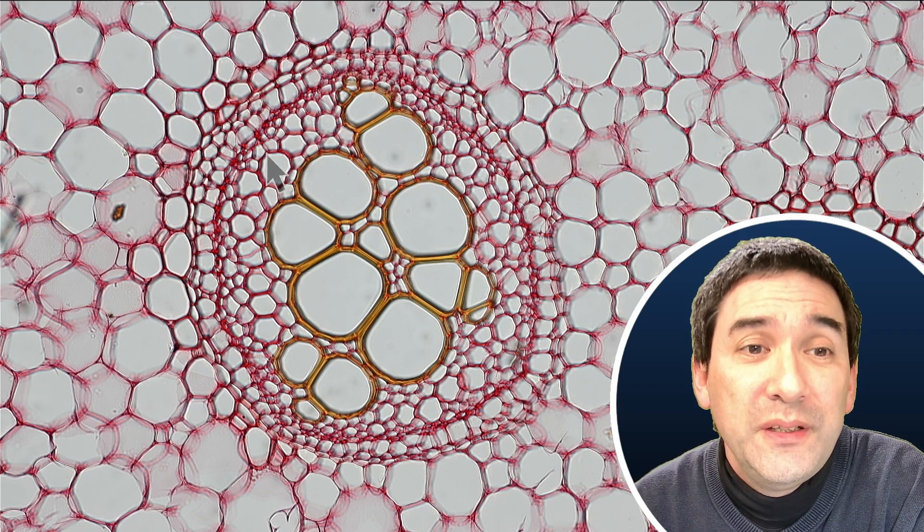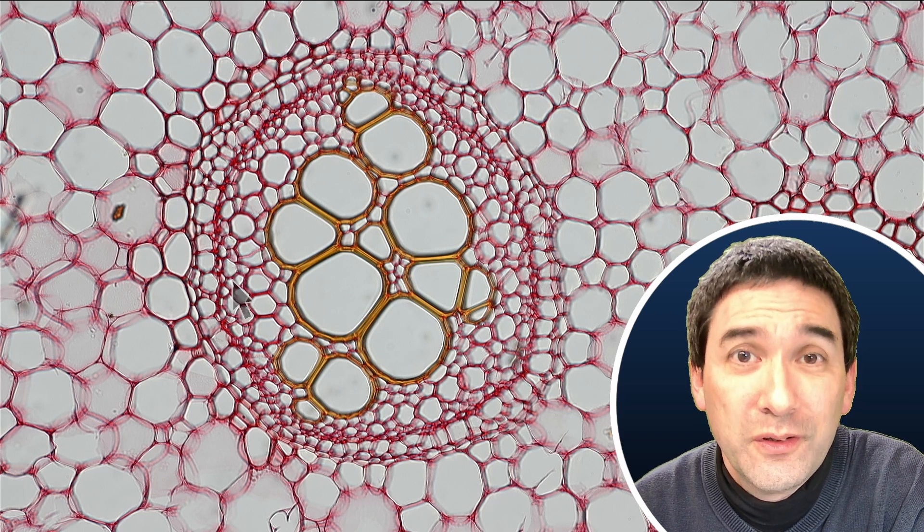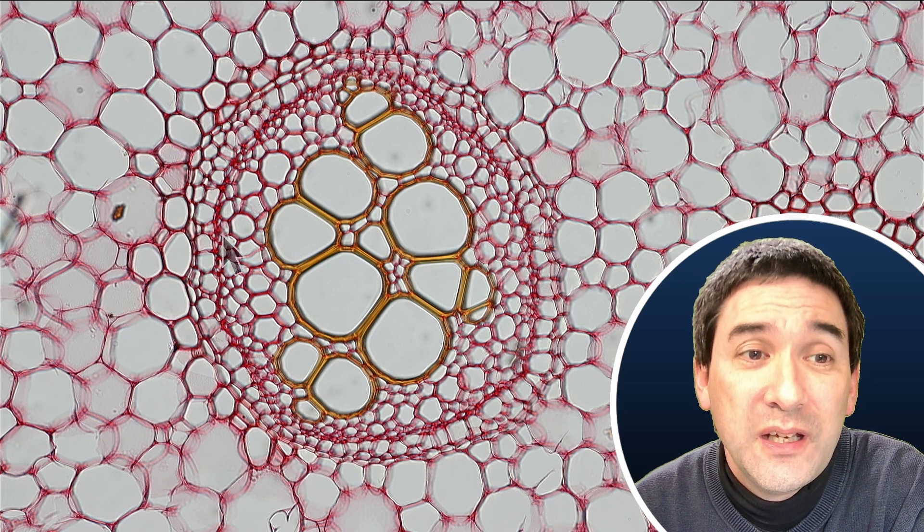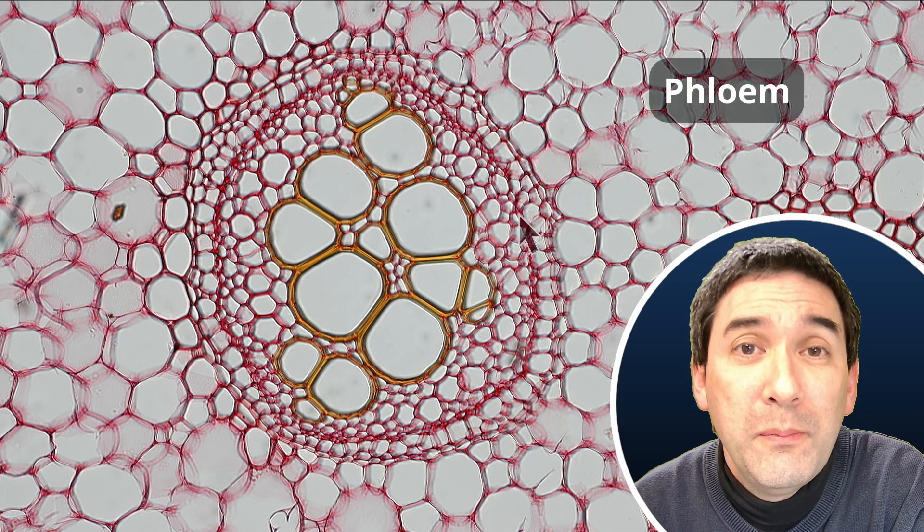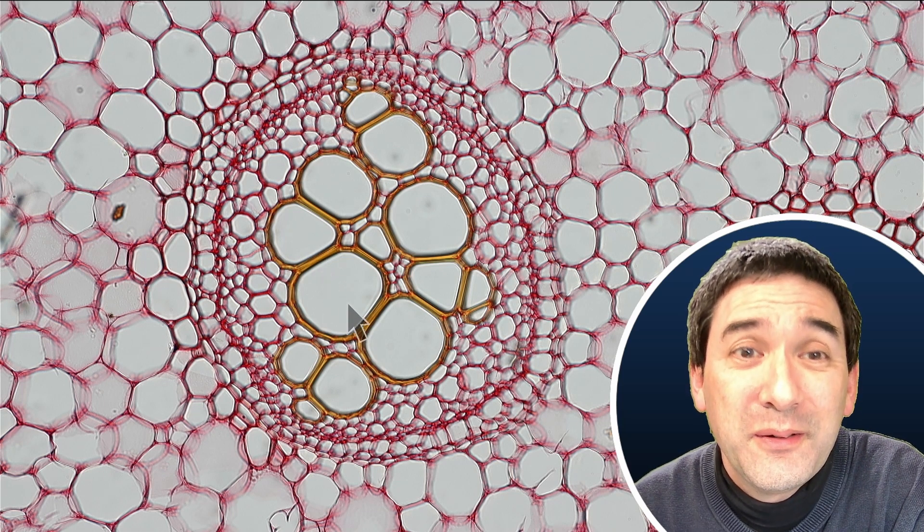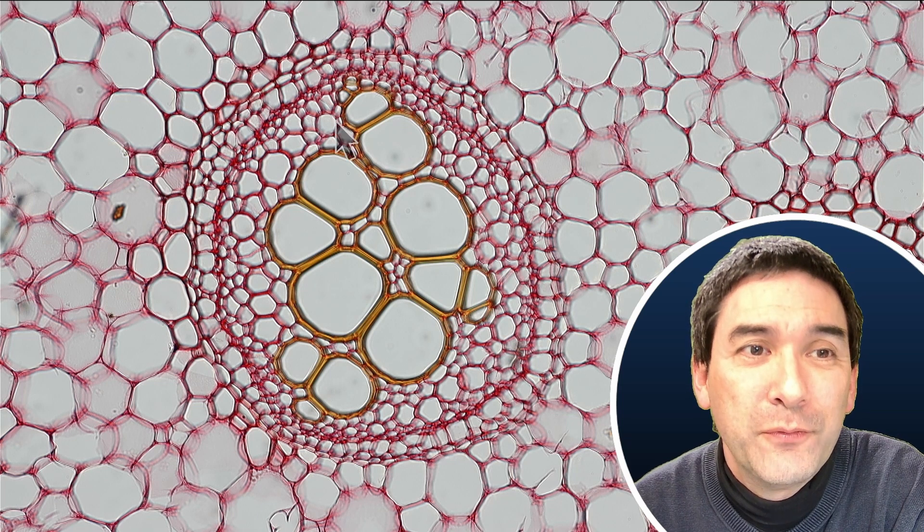And surrounding the xylem here, these are the cells that transport the products of photosynthesis, sugar, basically down to the roots. So you see that this phloem, as it's called, is surrounding the xylem, which is also a very interesting and typical structure of this type of fern here.